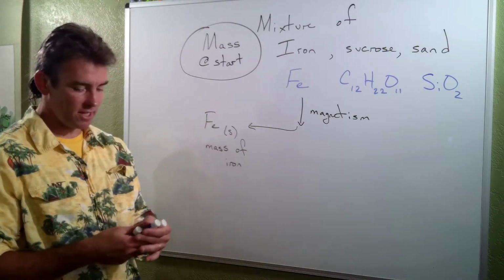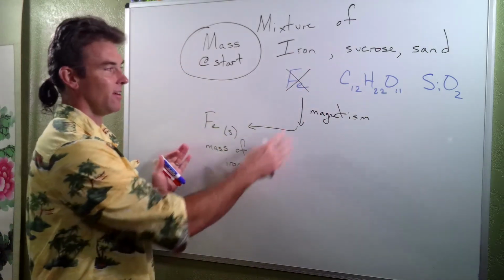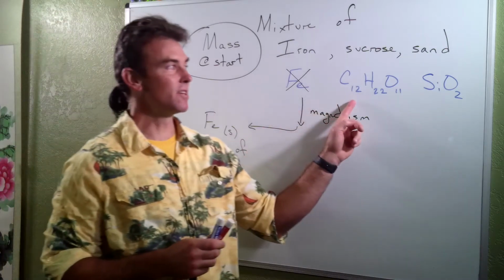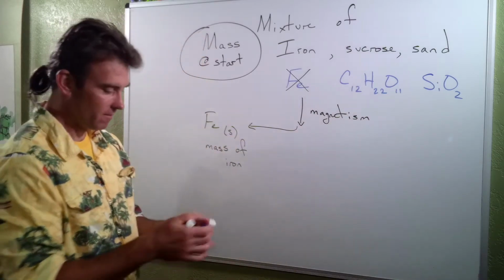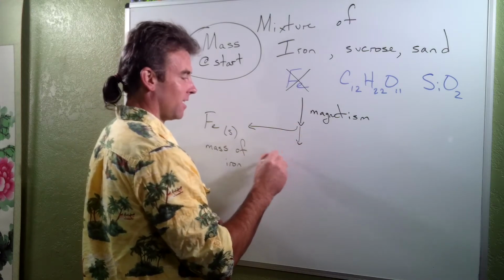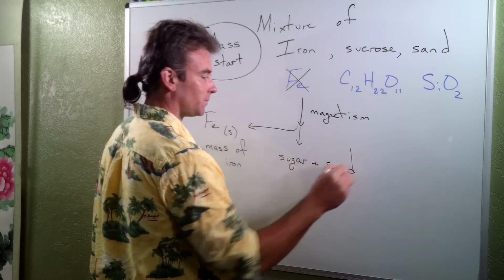So, good news is, we just did our lab, and we've gotten rid of all the iron. Now that has used some sort of physical property to separate out the iron. Now we've got essentially sugar and sand. So the very next step, after we've magnetically dealt with the iron, is, let's just put sugar plus sand in our mixture.